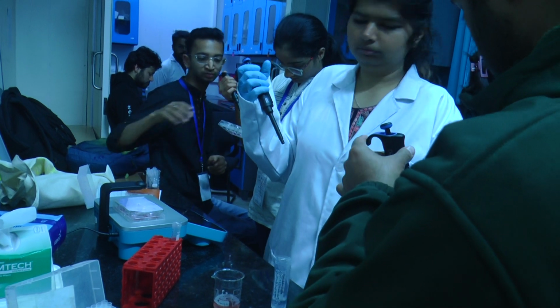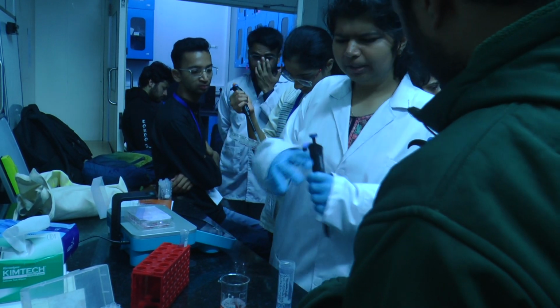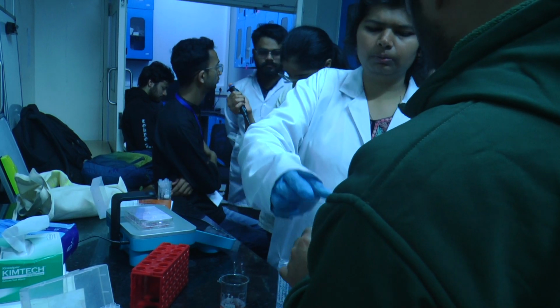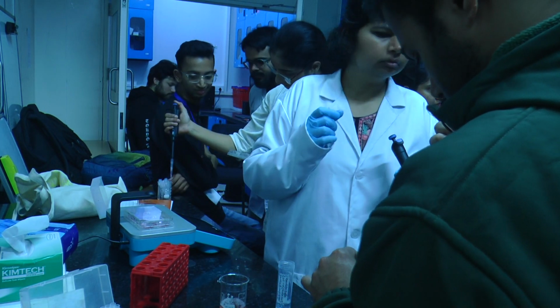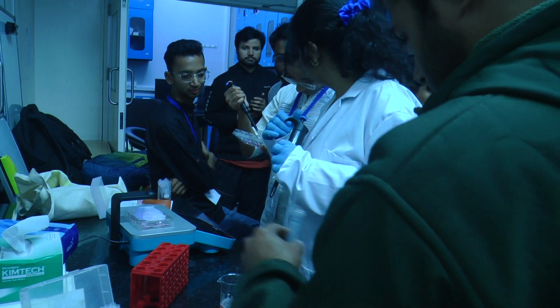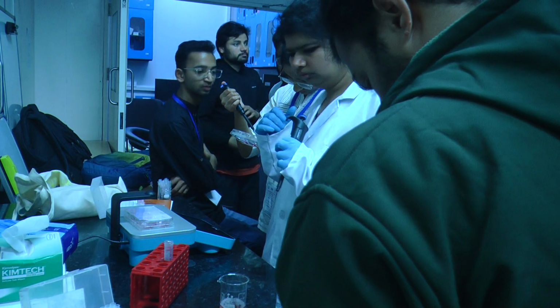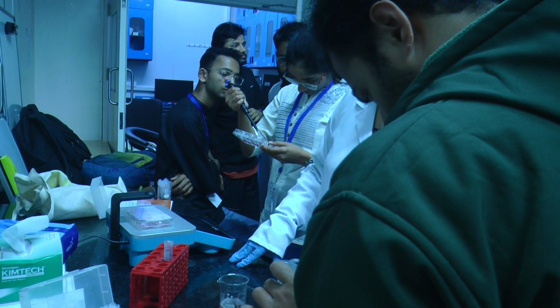It's concentration. Whenever we have some system, like a vesicle system or a normal GUV system, suppose I prepare it in 300 millimolar. It will encapsulate 300 millimolar inside, and outside it will be there too, because yesterday you did a hydration, so that will be common.